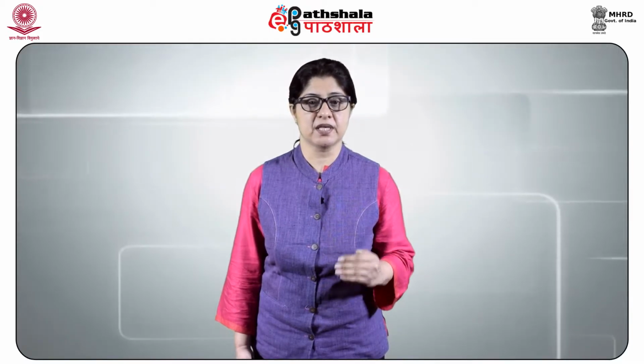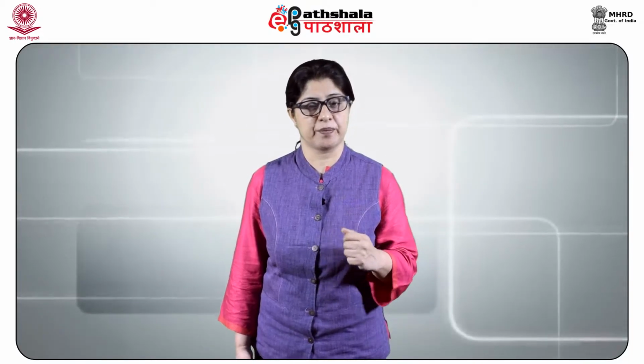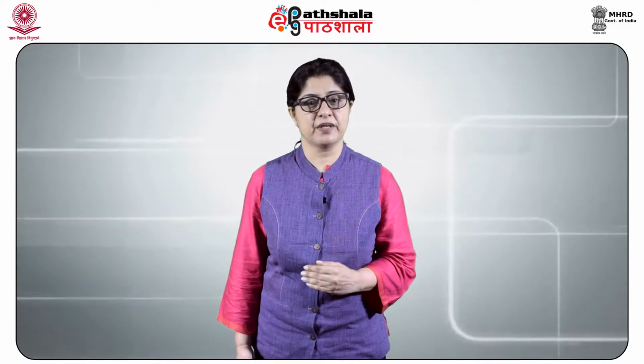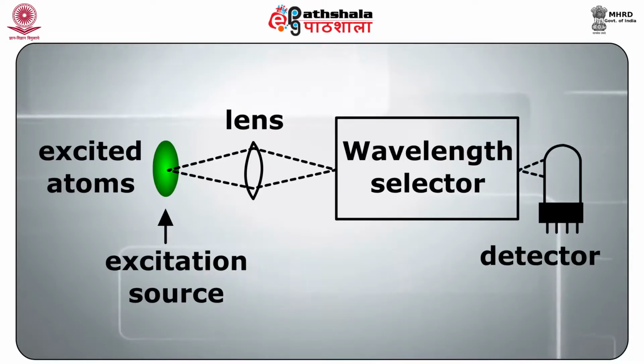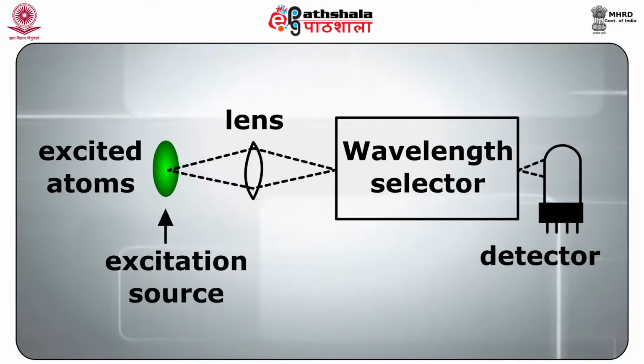The use of mirrors, properly placed, also eliminates the chromatic and the spherical aberrations encountered with the lens optics. At the exit slit of the spectrometer, the radiation is sensed by the photodetector. In older instruments, photographic film was used to record the spectra, but most modern systems use photomultiplier tubes or diode arrays linked directly to computer-driven data processing systems. The given figure shows the instrumentation for atomic emission spectroscopy.